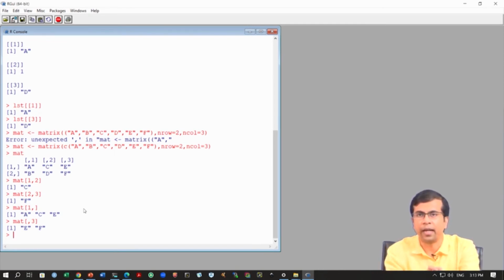So, remember this matrix part, because this is very important. It will come up when we start loading our data. There is another concept called the data frame, which could be a combination of all these different data types. All right, so I think this is clear, how we get to the different types of data and how you start working with them. What I will do now is load the raw count data that we have generated, and we will start performing some operations on this data set.